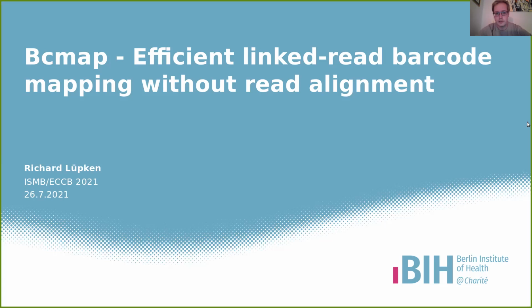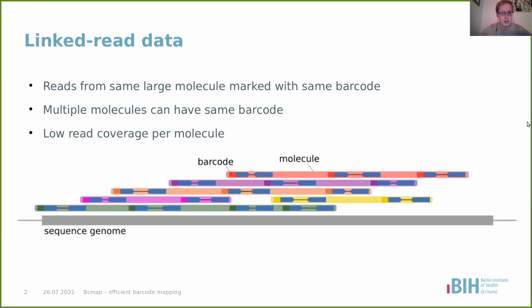I'm from the Berlin Institute of Health, and today I will tell you about mapping linked read barcodes to a reference without performing a read alignment.